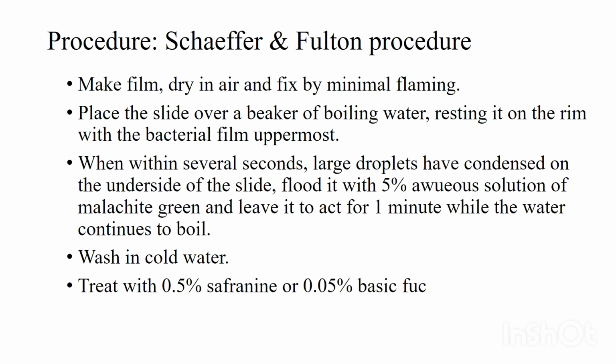To make a smear, we take the suspected sporulating colony and make a thin film that has to be dried and fixed with minimal flaming. We place the slide over a beaker of boiling water, resting it on the rim with the bacterial film uppermost.